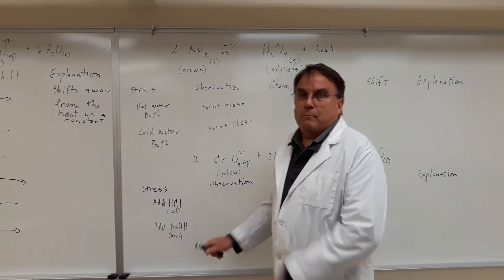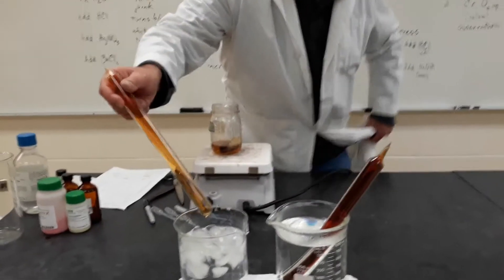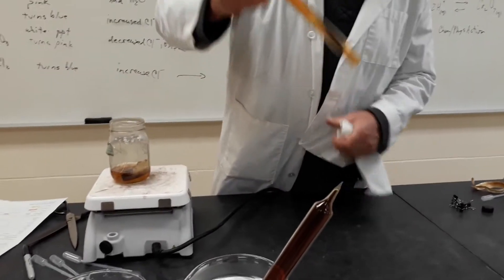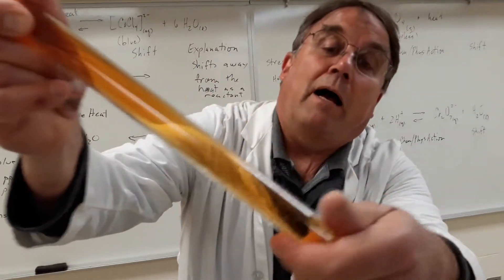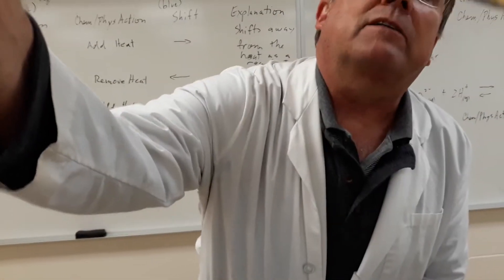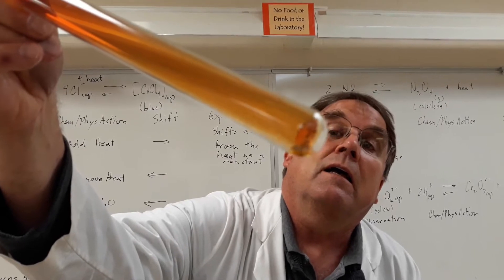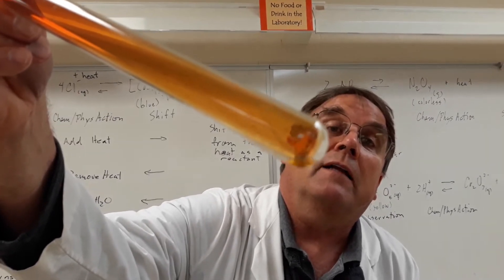And then another thing happens that's kind of cool. If we zoom in on this, we can see what looks like moisture on the outside. If I dry it off, it's actually moisture on the inside. Guess what that moisture is? It's liquid nitrogen dioxide.